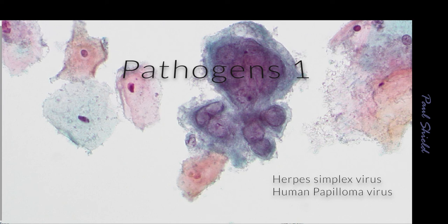Hi, it's Paul. In this clip we're going to look at the two common types of viral infection that we can diagnose cytologically in cervical samples.